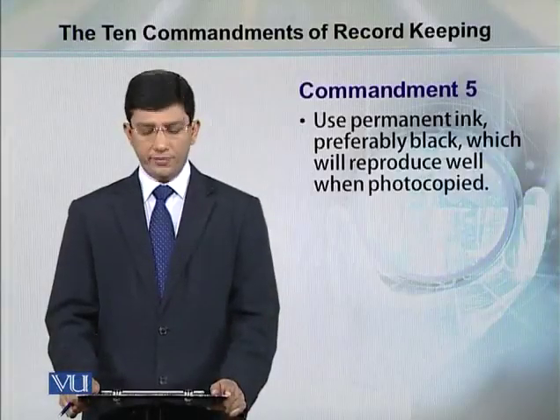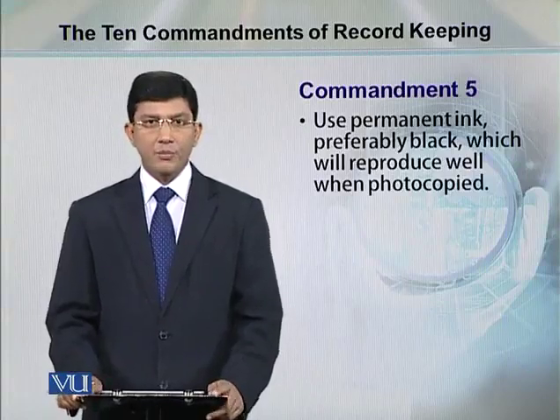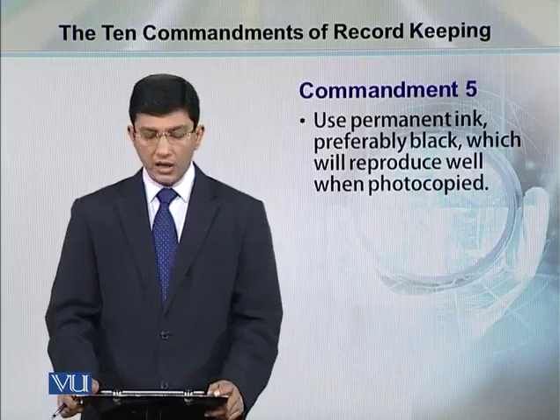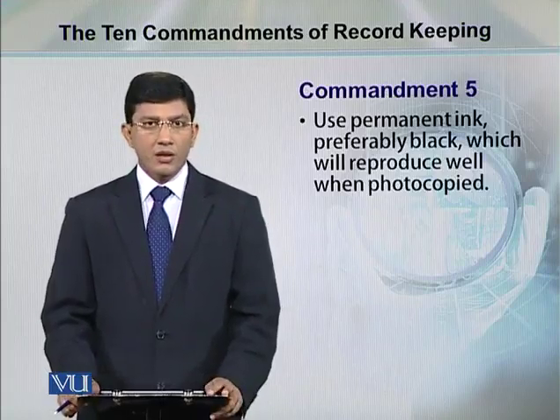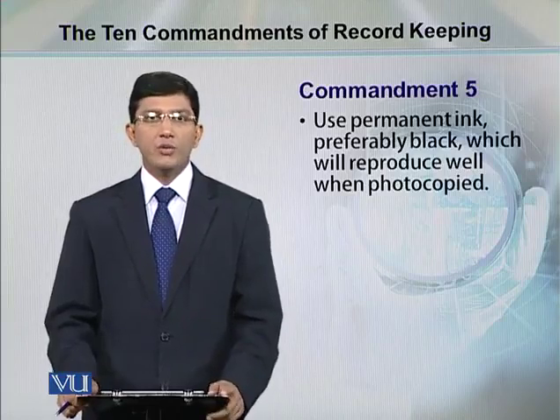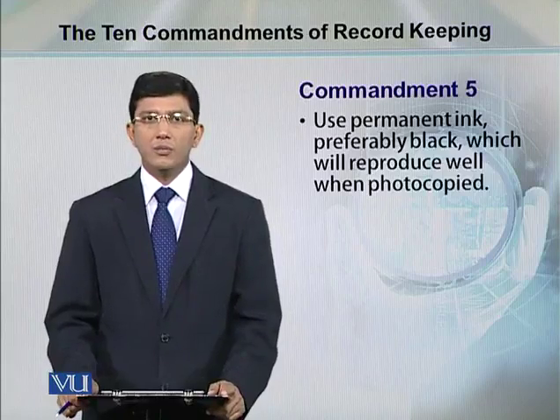Commandment number 5. Use a permanent ink, preferably black, which will reproduce well when photocopied. Whenever you write something in the notebook, occasionally you may need to make a photocopy for your personal use or to give it to some of your colleagues or lab mates.